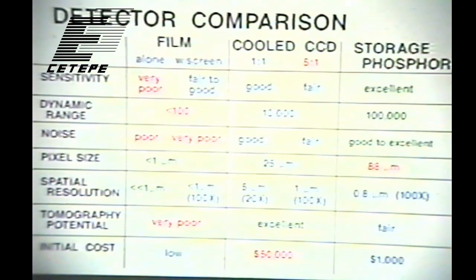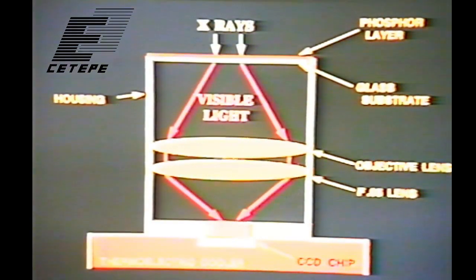So right now, CCDs are still the best. But in about 5 years, or that would be my guess, I think these amorphous silicon flat panels will take over. Which is a consideration for us, because if we're going to build a detector system right now, we're going to propose, I think, a CCD-based detector. But maybe that guy Igor, the Russian guy, was talking about getting one 3 years ago, so maybe they have one by now. But I think if we wrote the same proposal in a few years, we'd use something else, probably amorphous silicon.